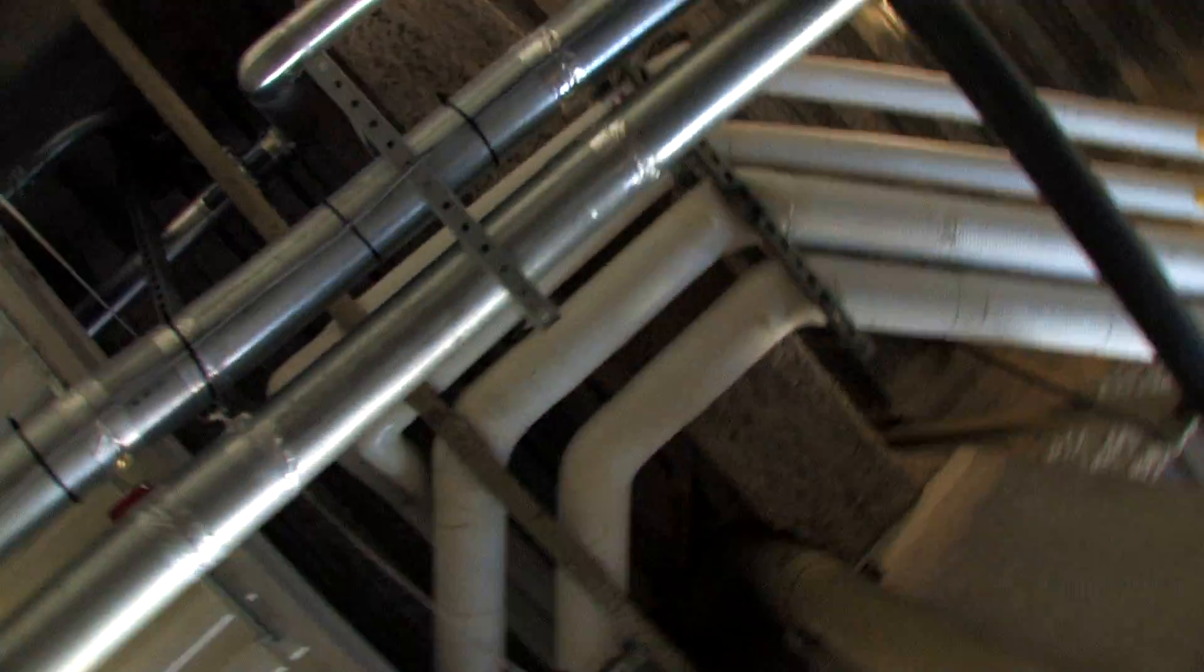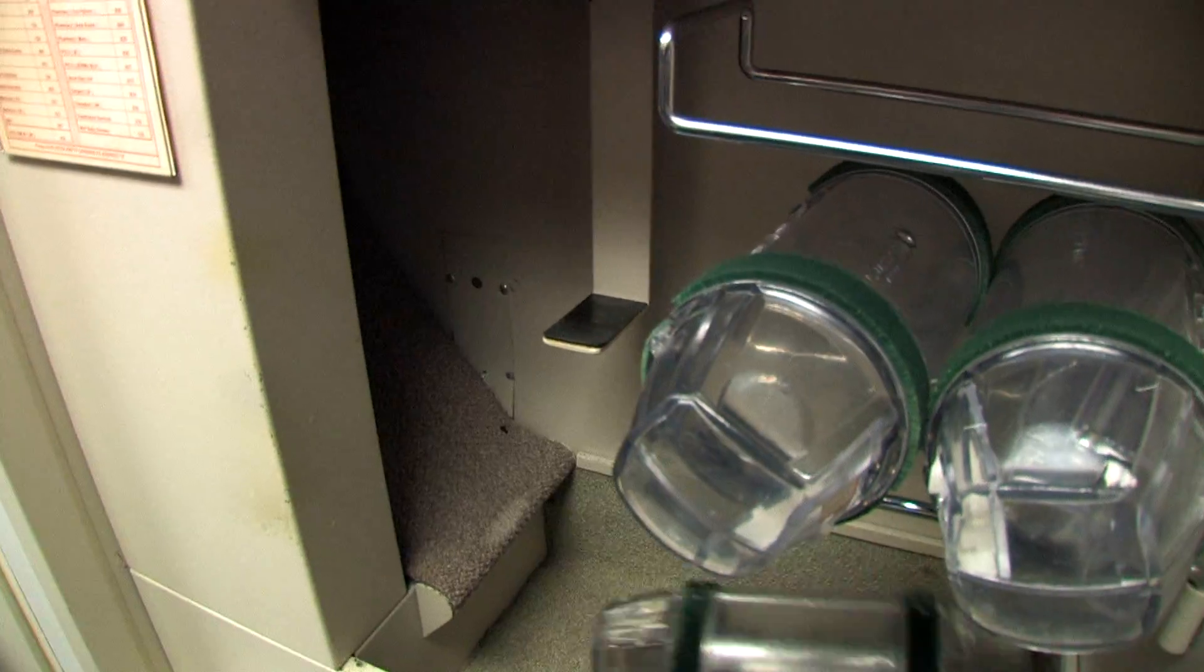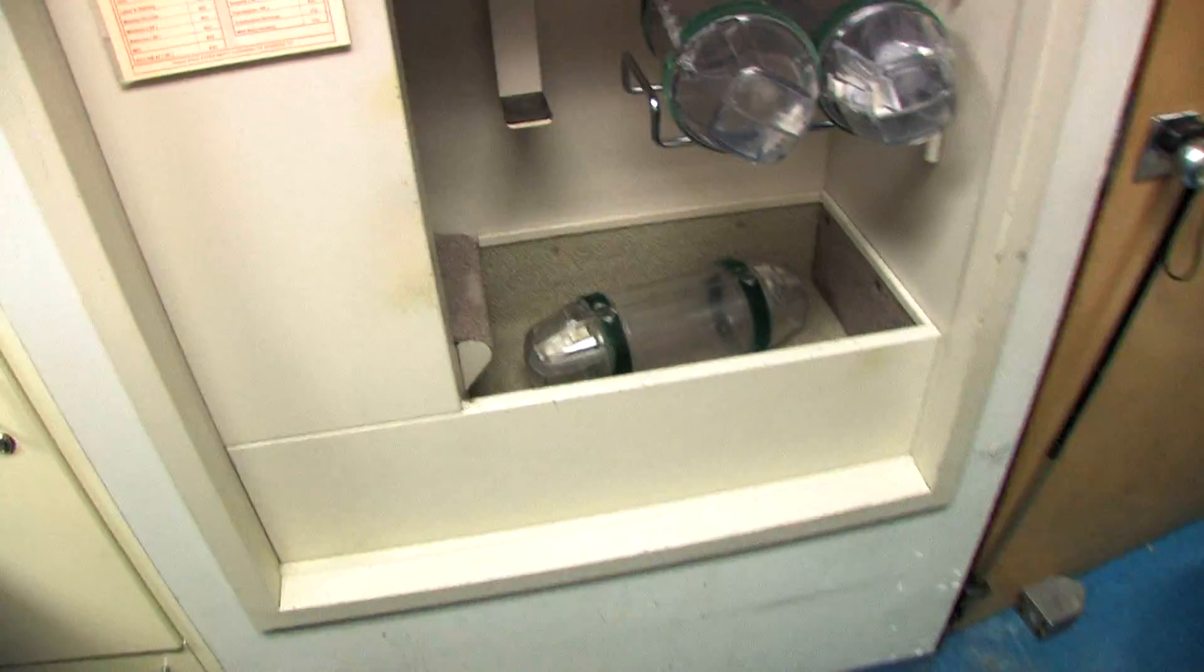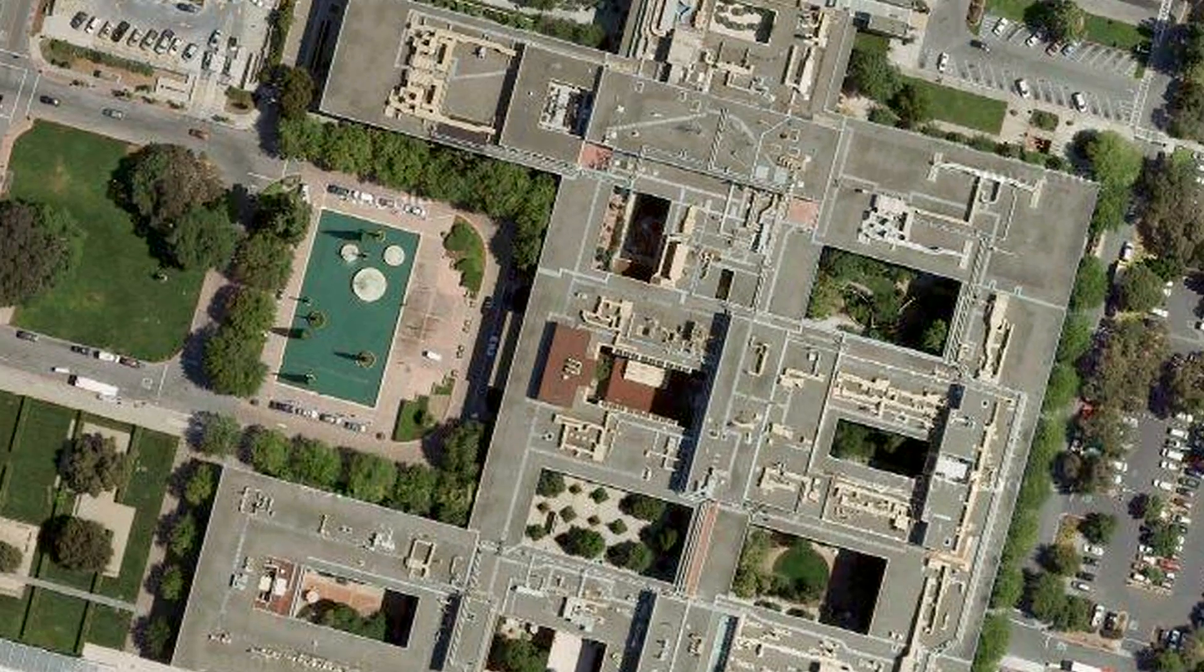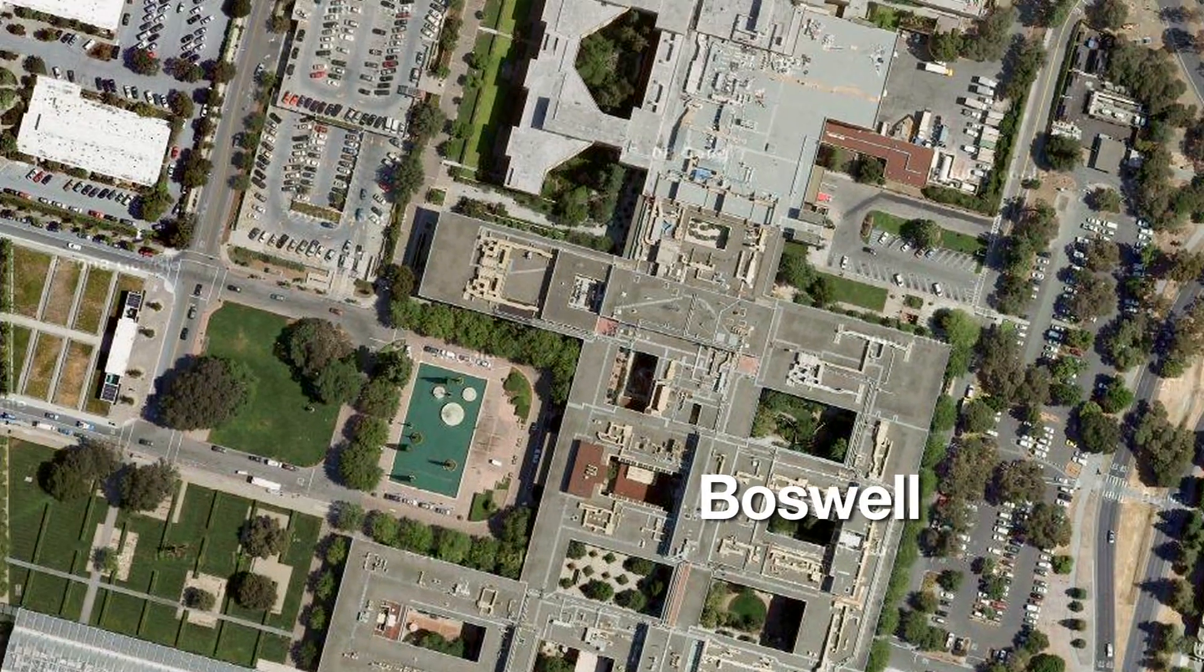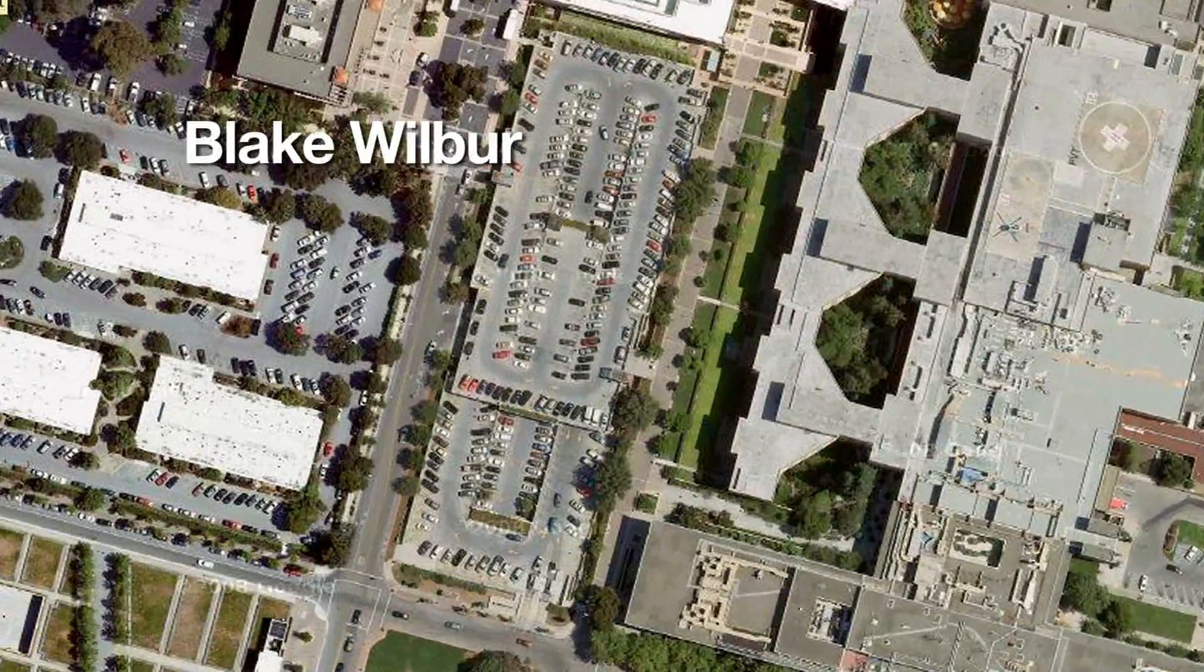We do approximately 7,000 transactions a day. There's approximately 123 to 129 stations which covers Blake Wilbur, Cancer Center, Lucille Packard Children's Hospital, and Stanford Hospital and Clinics. The longest trip would be from Boswell blood draw in A101 over to Blake Wilbur.